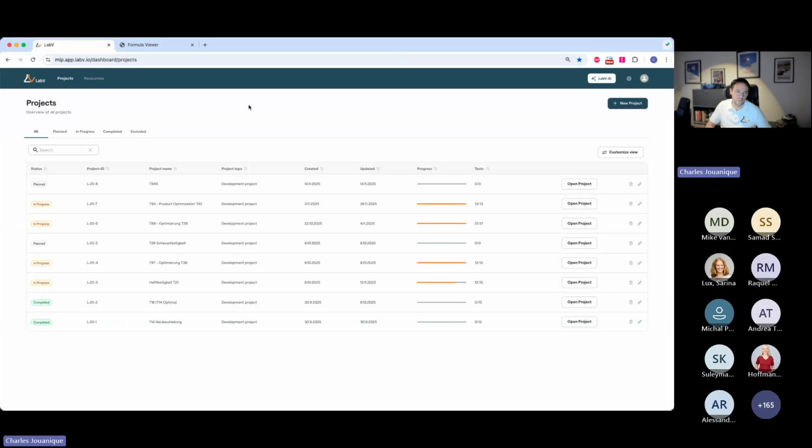I have a data hub, which is in the background. That's where the data is imported. That's where the data is harmonized. That's basically the database and everything around so that the data can be accessible and usable, right? And then I have 3 other elements that I can show now: the project hub, the resource hub, and our AI assistant.